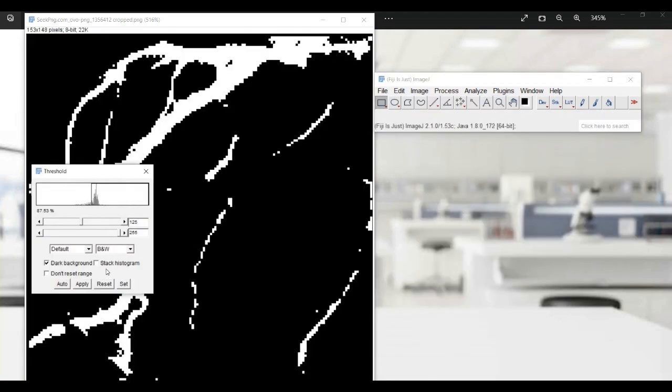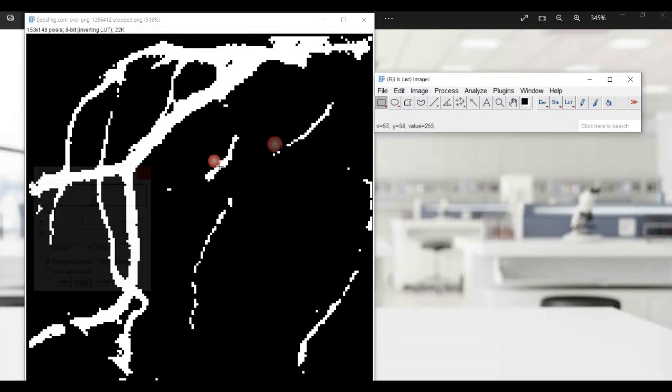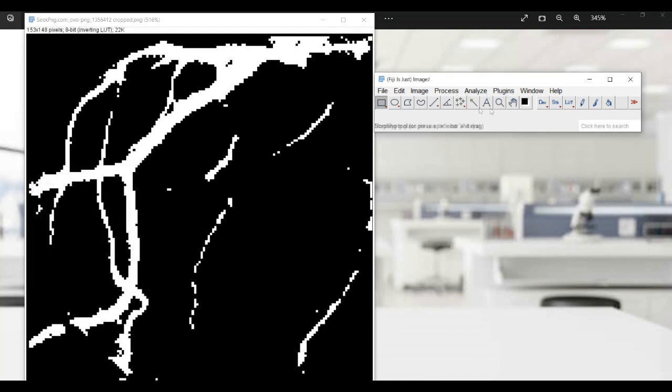The next step is using the wand tool to select the blood vessels that you need to measure, which provides you the area of the blood vessels.